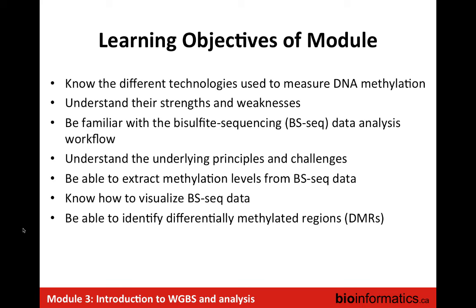The learning objectives of this module are to understand the different technologies used to measure DNA methylation. Even though we're going to focus on next-generation sequencing and whole genome bisulfite sequencing, we'll first review the strengths and weaknesses of the different approaches, in particular microarray approaches as well. After that, we'll go over the bisulfite sequencing workflow. You'll see that there are some interesting twists in the bioinformatic analysis of these methylation data sets. It's one of the most unusual next-generation sequencing analyses because of the way the DNA is actually modified in the process, as we'll see.